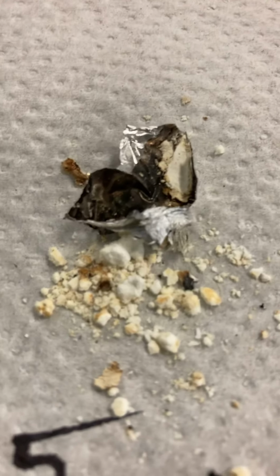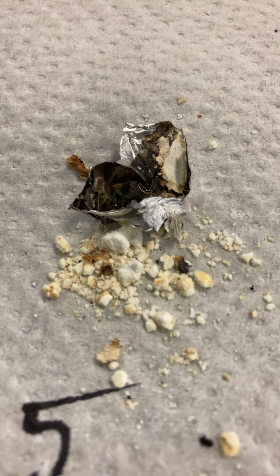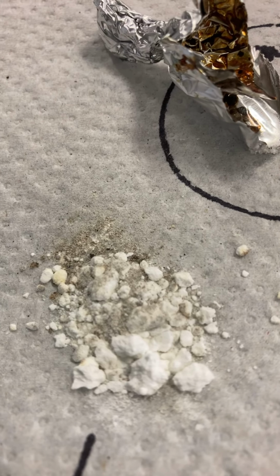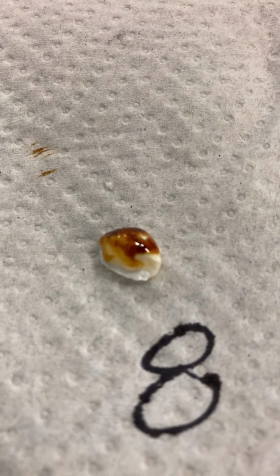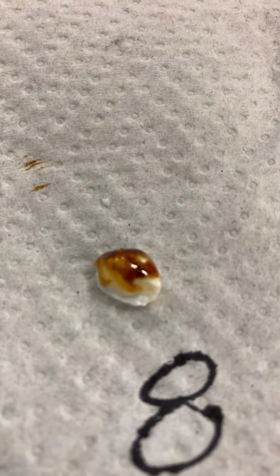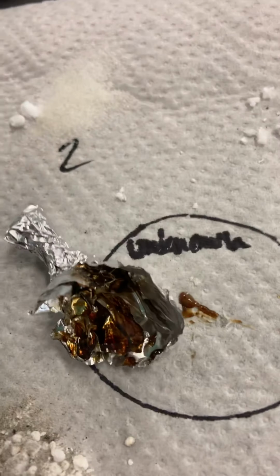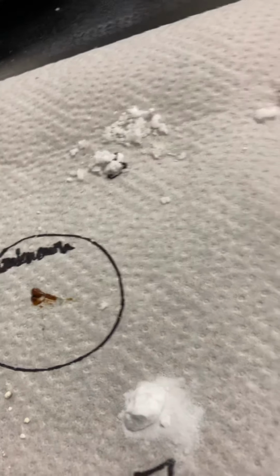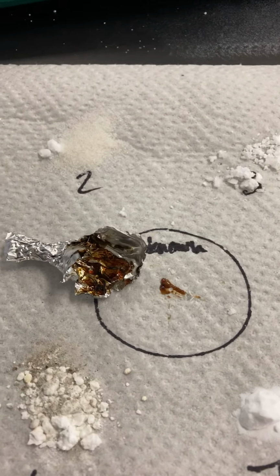This one turned black, not really super gooey, but you guys can definitely tell that it melted and then burned. 6, no melting, but a little bit of burning of whatever that powder was. 7 was completely unchanged. And 8, again, you have a little bit of black goo, but it just clumped together mainly. Okay, and then again, your unknown completely burned up and left this black goo behind. If I smell it, it also smells sweet and has a marshmallowy smell to it as well.